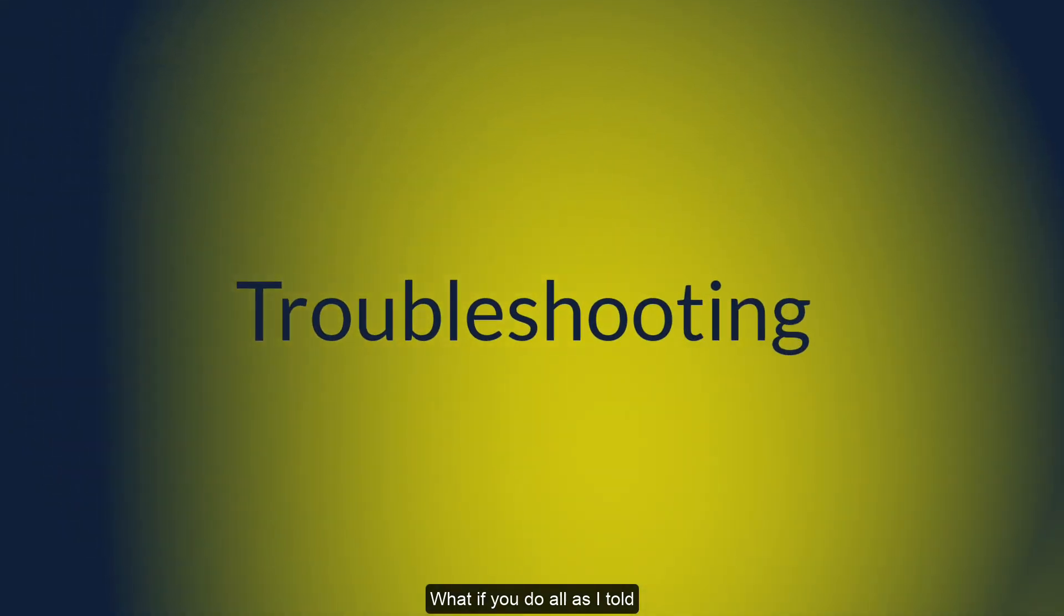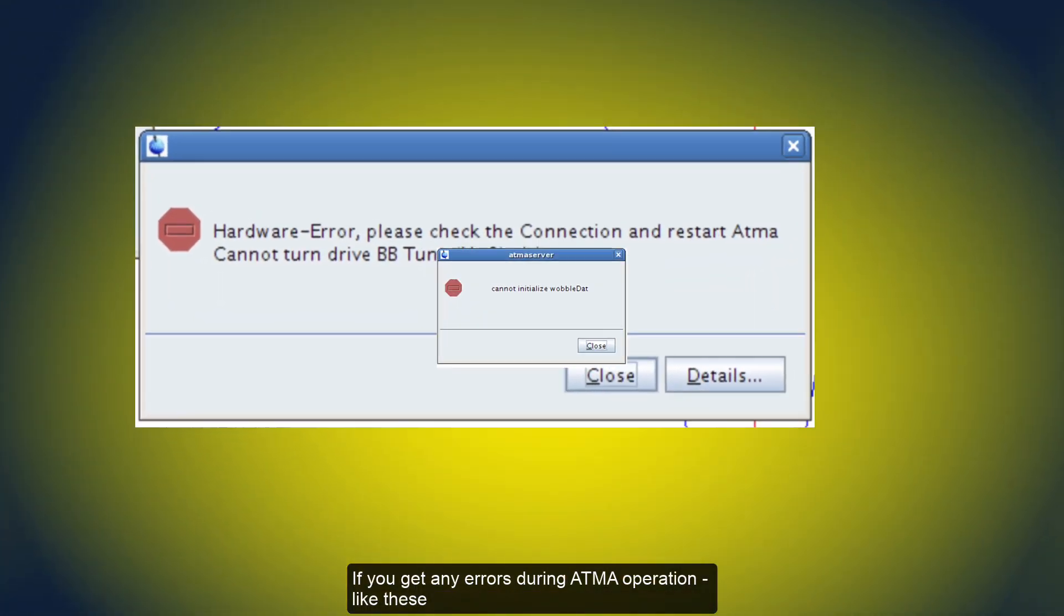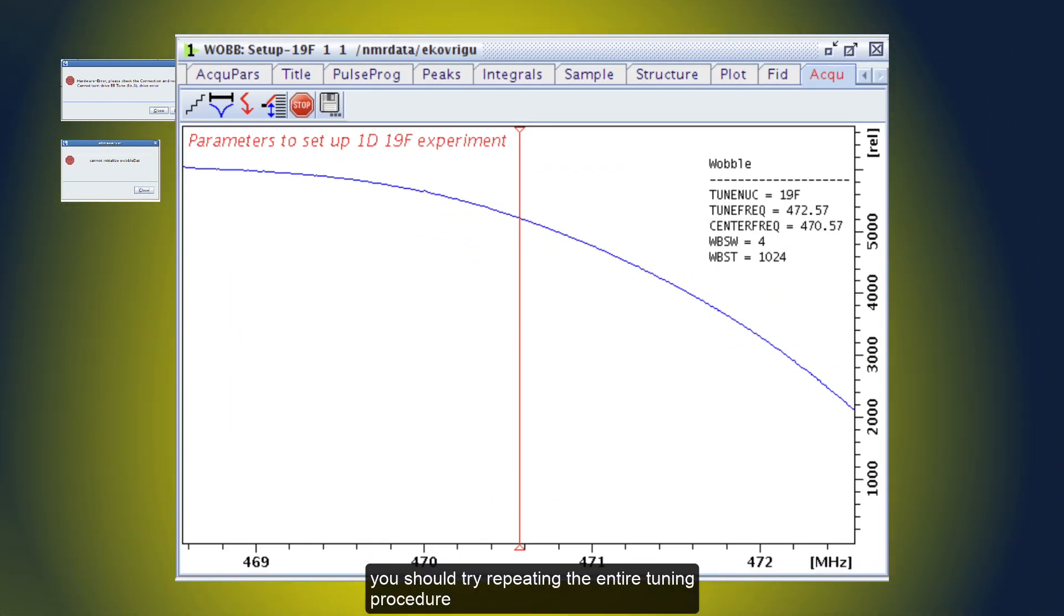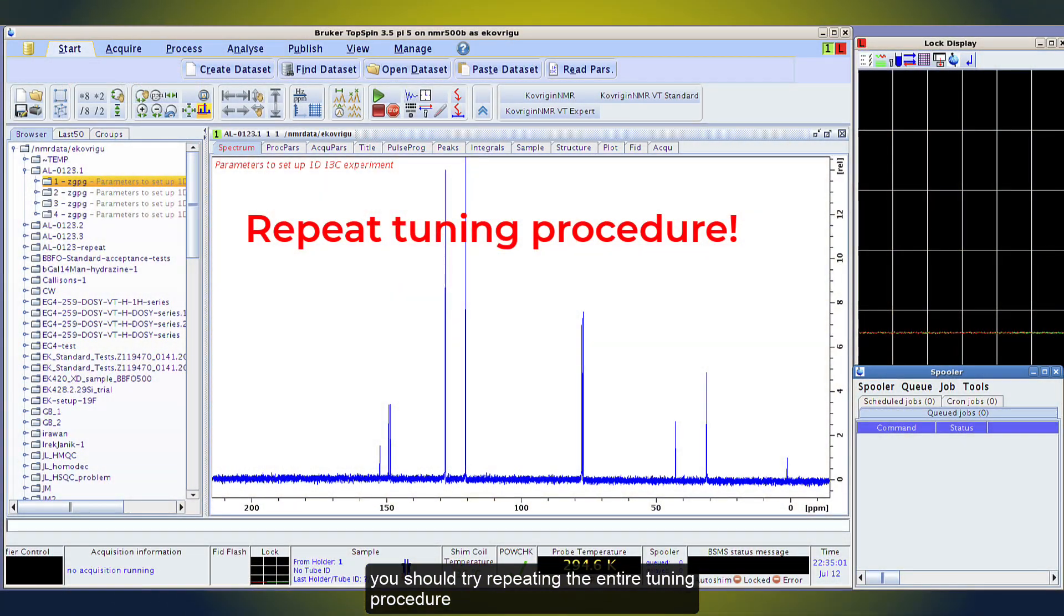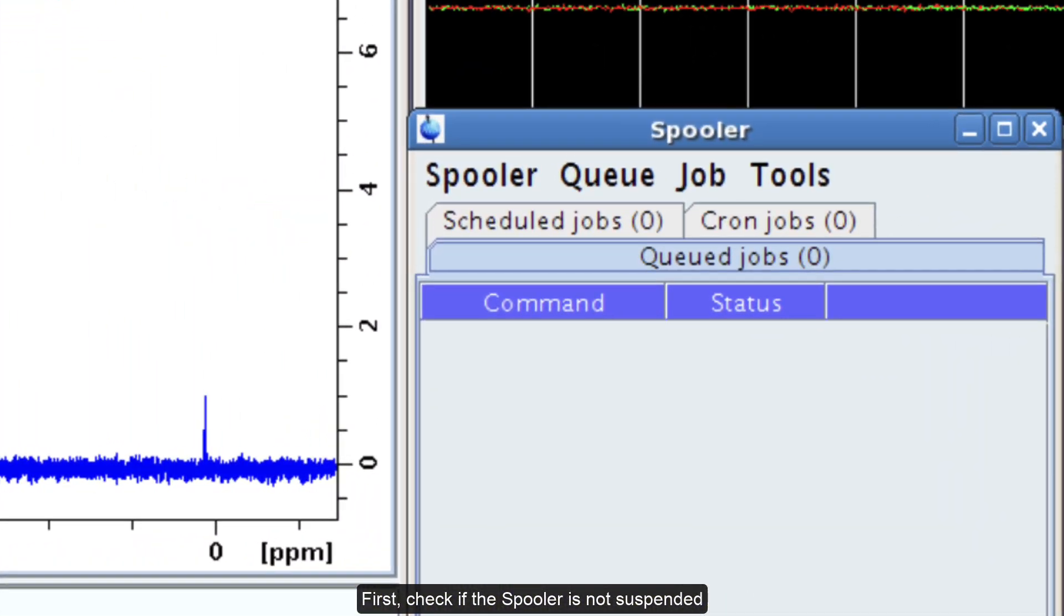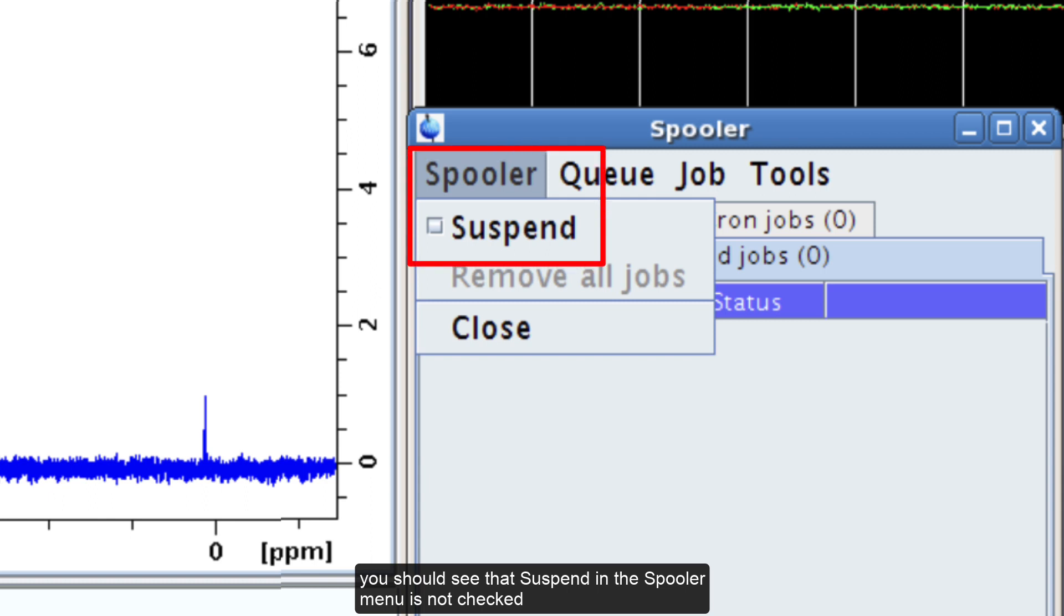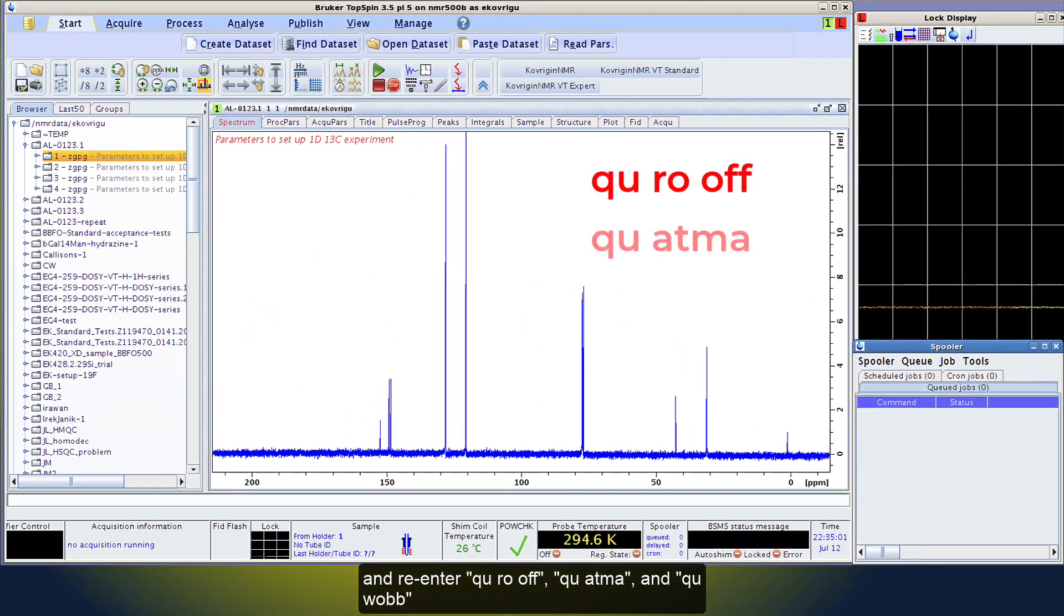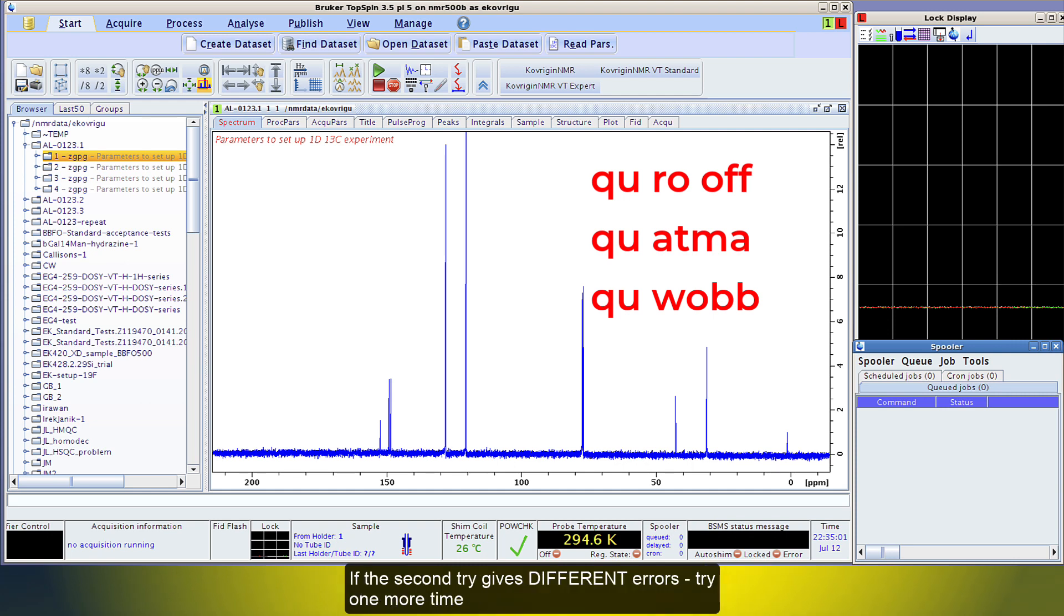What if you do all as I told you, but tuning does not succeed? If you get any errors during an ATMA operation like this, or wobb shows you a poorly tuned probe in the end, you should try repeating the entire tuning procedure. First, check if the spooler is not suspended. You should see that suspend in the spooler menu is not checked. Then re-enter QU-RO-OFF, QU-ATMA, and QU-WOBB. If the second try gives different errors, try one more time. ATMA is capable of recovering from some errors by itself. If you get the same errors, the problem is persistent.